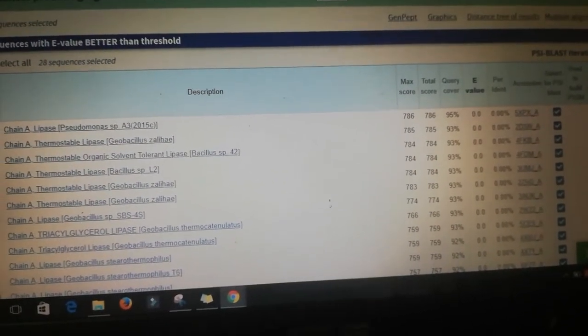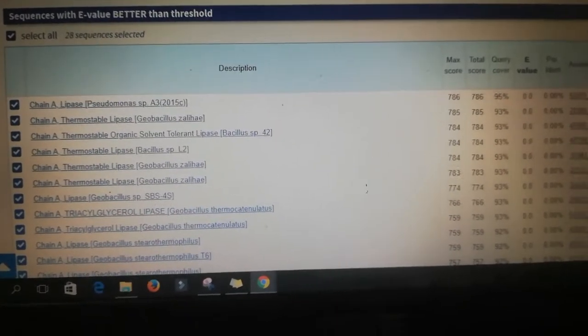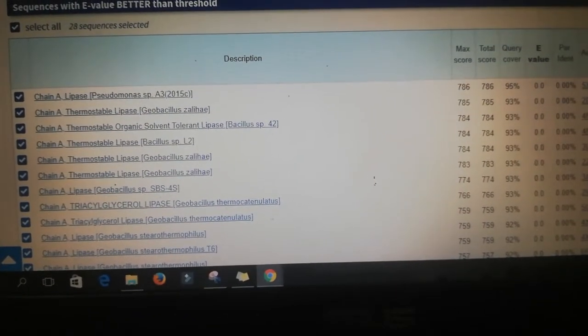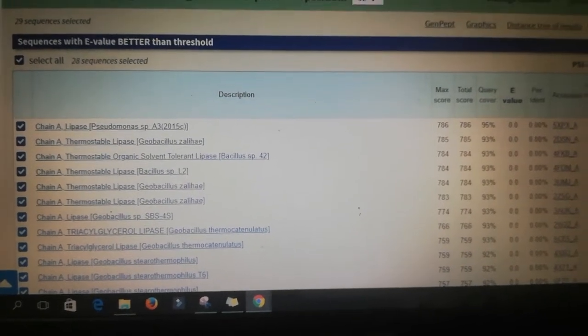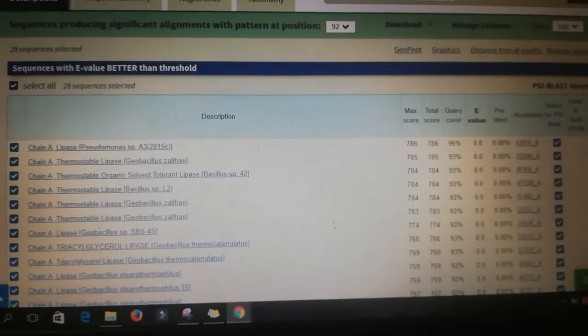So it's being more specific to our query.